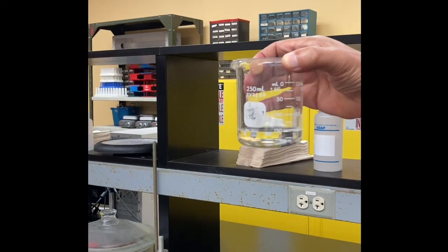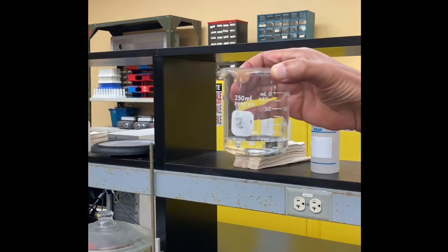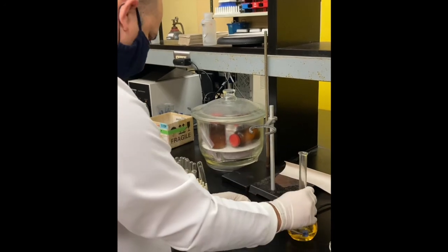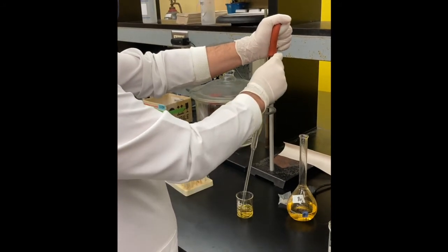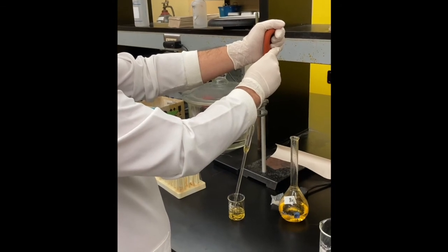So the next thing to do, we will need to add bromine. Okay, so now we are prepared to add 10 milliliters of bromine into our solution of acetone and hydrochloric acid. So the pipette, 10 milliliters.